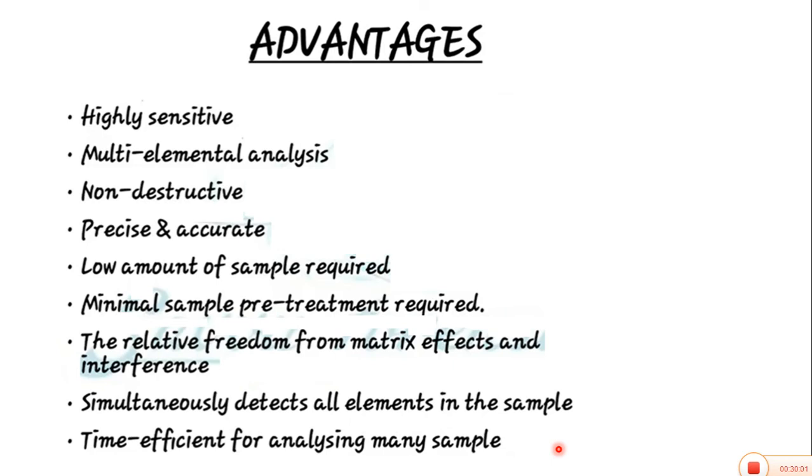Multi-element analysis: it provides more than 30 elements at a time. You should keep in mind how many elements could be analyzed at one time through this technique. Other advantages: it is a non-destructive technique, precise and accurate. A low amount of sample is required, because if there is only one wing of a fly, you can easily detect it and use it for the analysis of different elements.